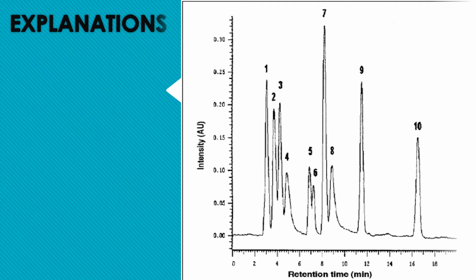Although these forces are relatively weak, a high number of molecules as well as an increase in molecular size will contribute to increased interaction between the analyte and the phases. Therefore, strong forces may be produced by these factors.